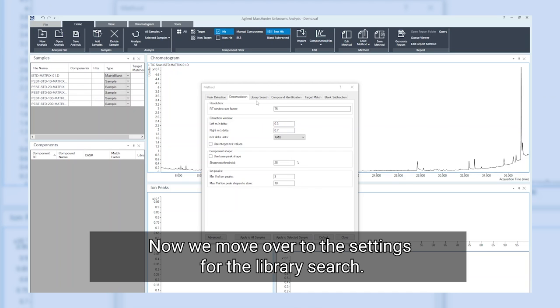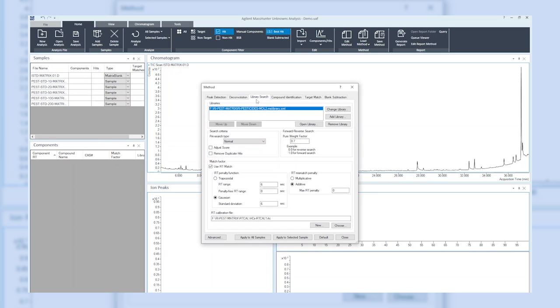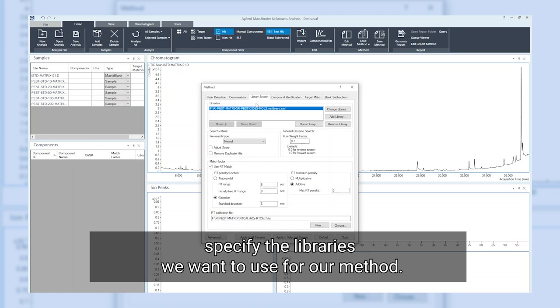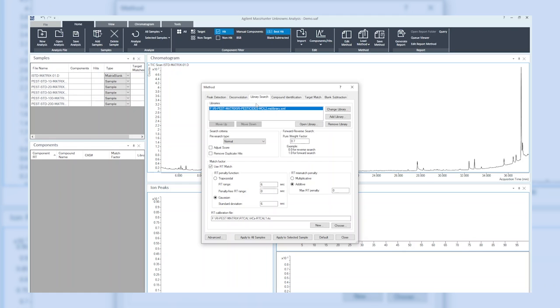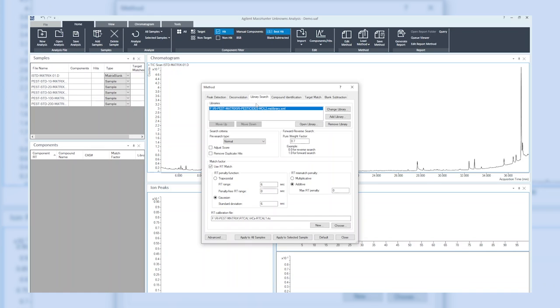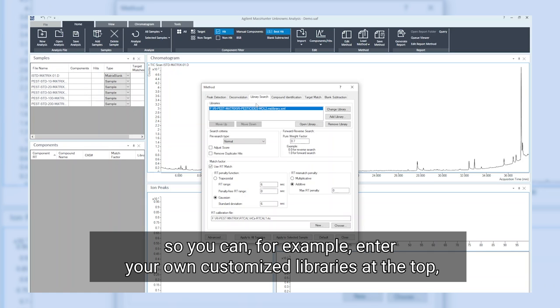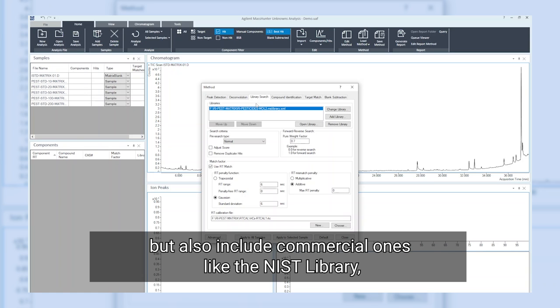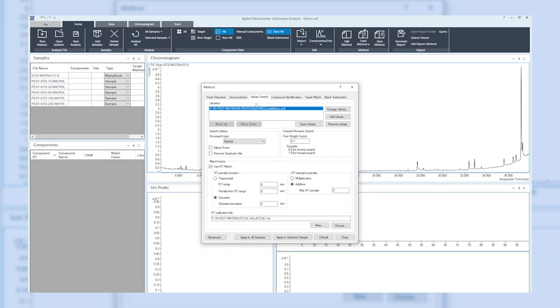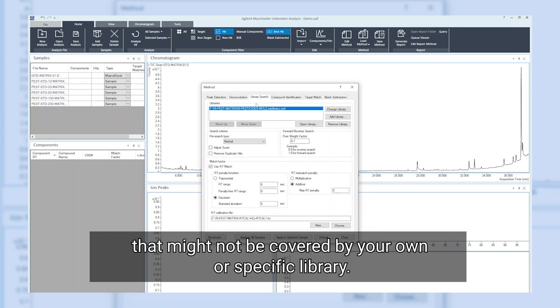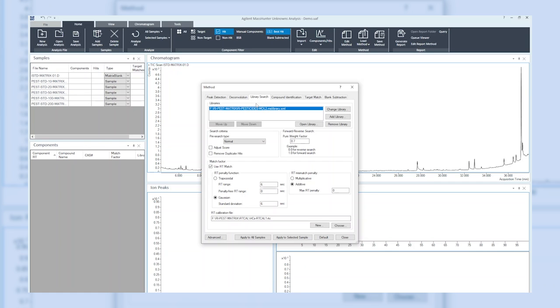Now we move over to the settings for the library search. Right at the top, we can specify the libraries we want to use for our method. MassHunter unknowns analysis can handle multiple libraries at the same time, so you can, for example, enter your own customized libraries at the top but also include commercial ones like the NIST library to see if something else can be found in your sample that might not be covered by your own or specific library.